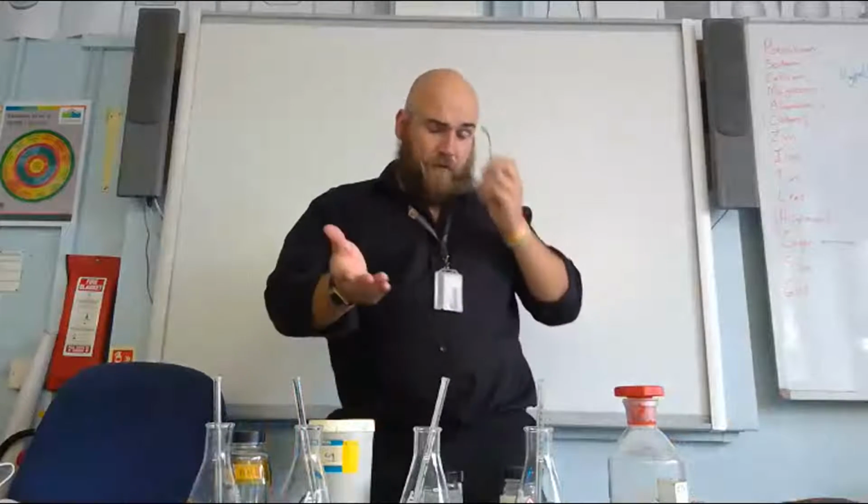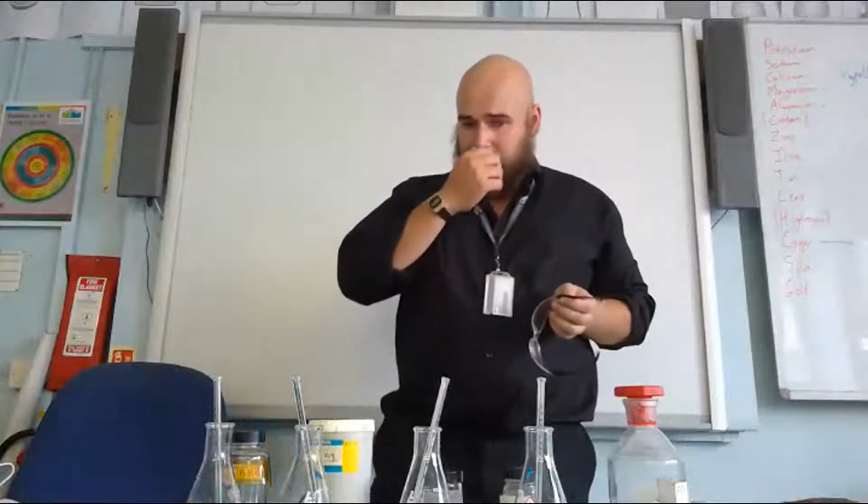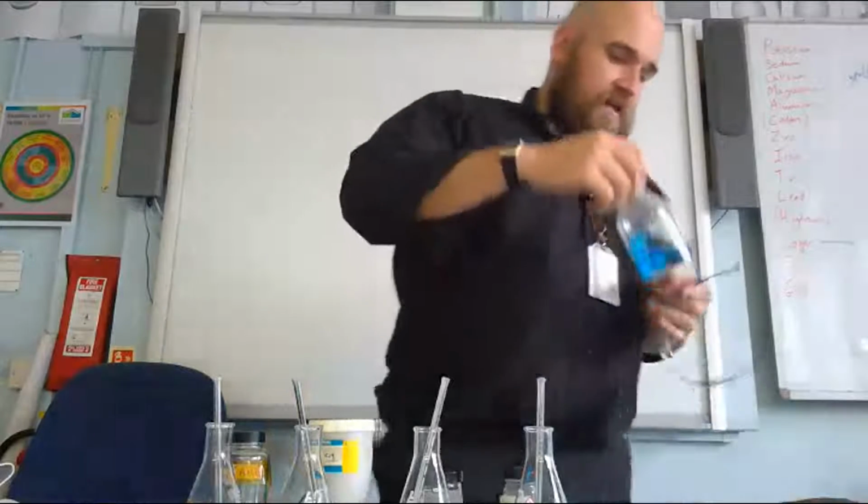Anything else you should keep the same? Maybe the starting temperature. Do you think the starting temperature will make a difference to how high the temperature will go in all 4 of these reactions? Probably will. And one more thing as well.